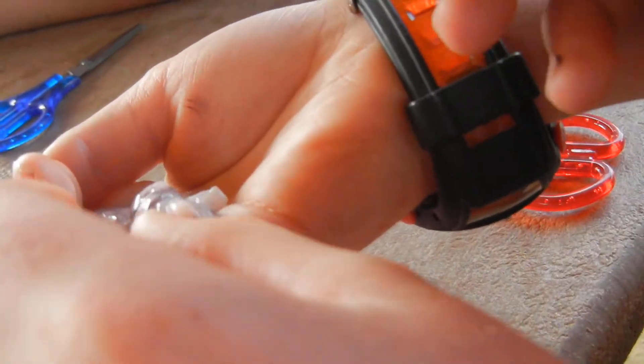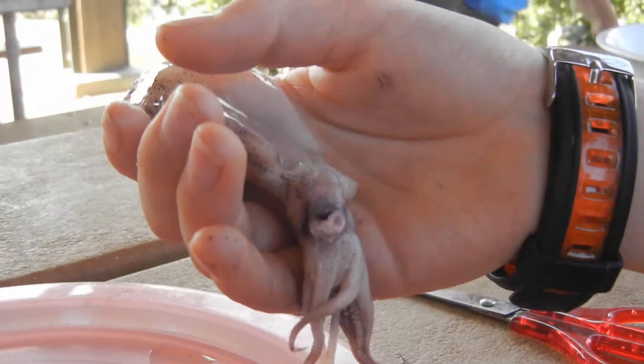Students compete to extract the beak. The instructor directs them to hold it in front of the camera. After some effort, a student successfully pulls out the beak and places it on the plate. The group examines it — it's small but visible. The instructor confirms they found it.